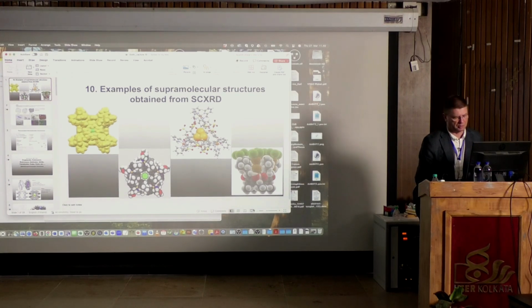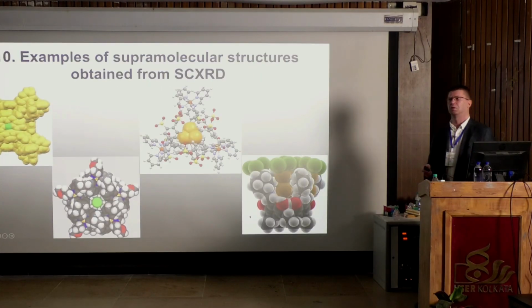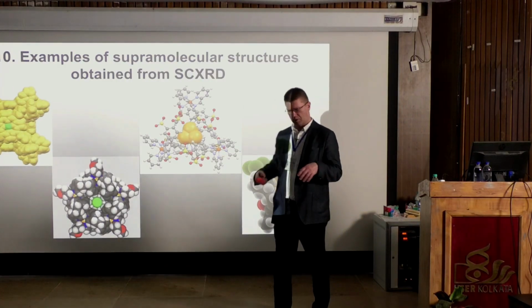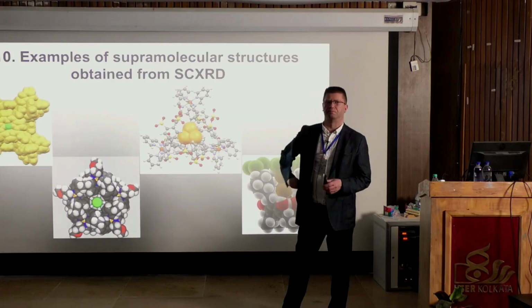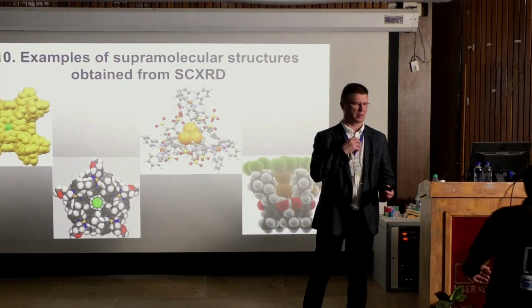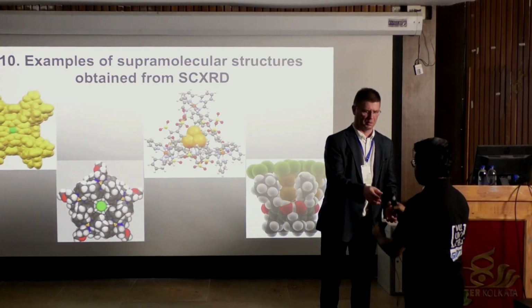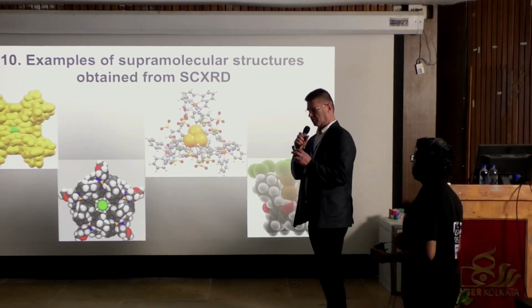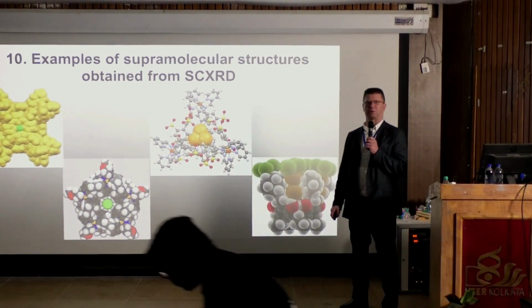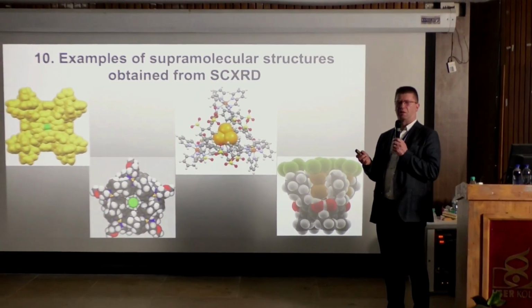Which might be scientifically more interesting, because these are examples of the structures collected over the years. I think we can take that one and then change the battery. There it is. This thing works. Okay.